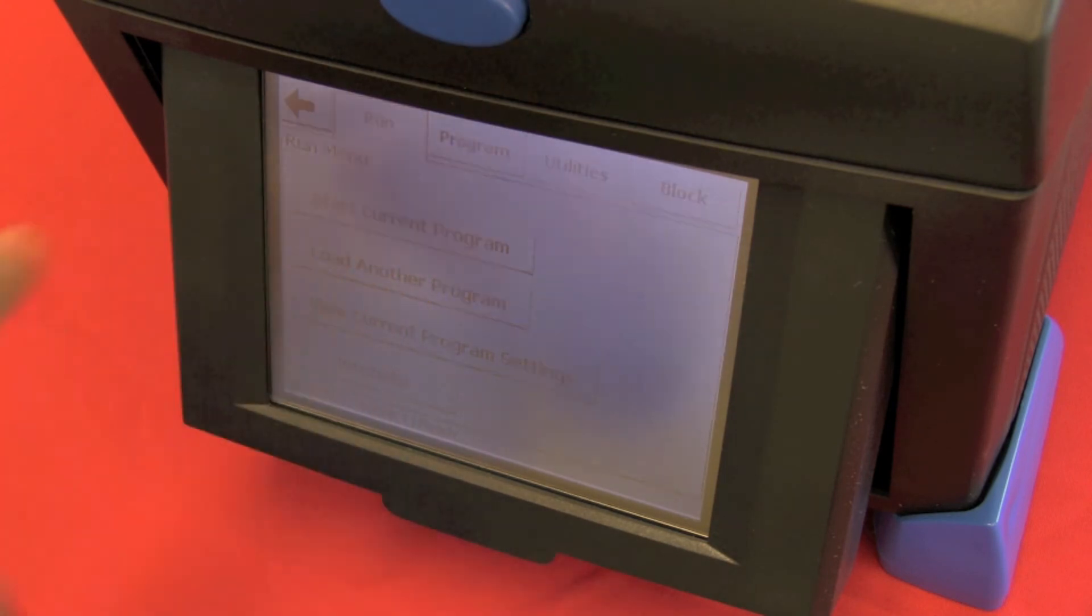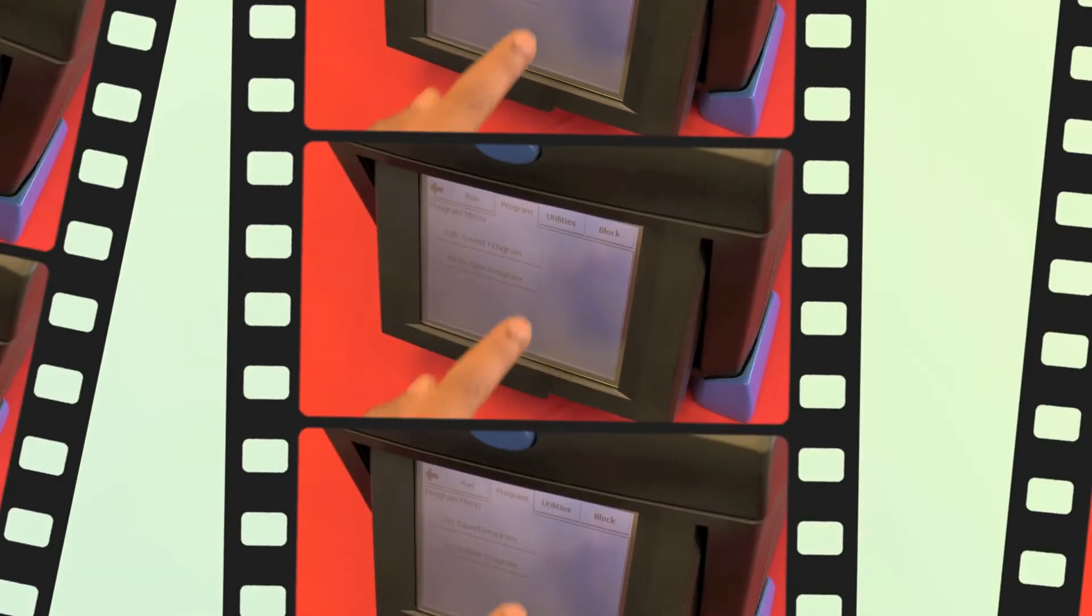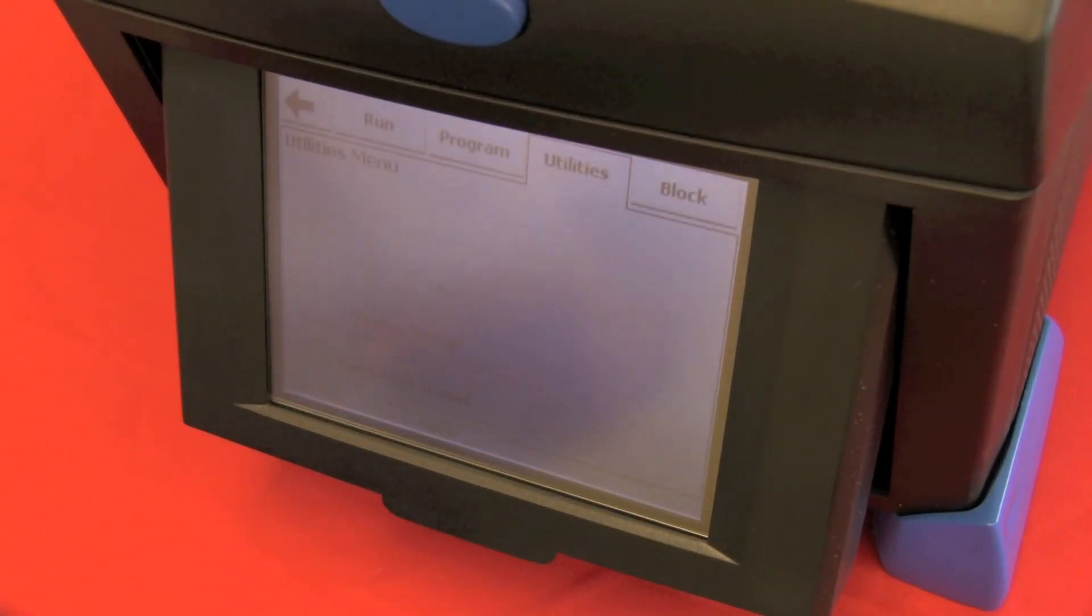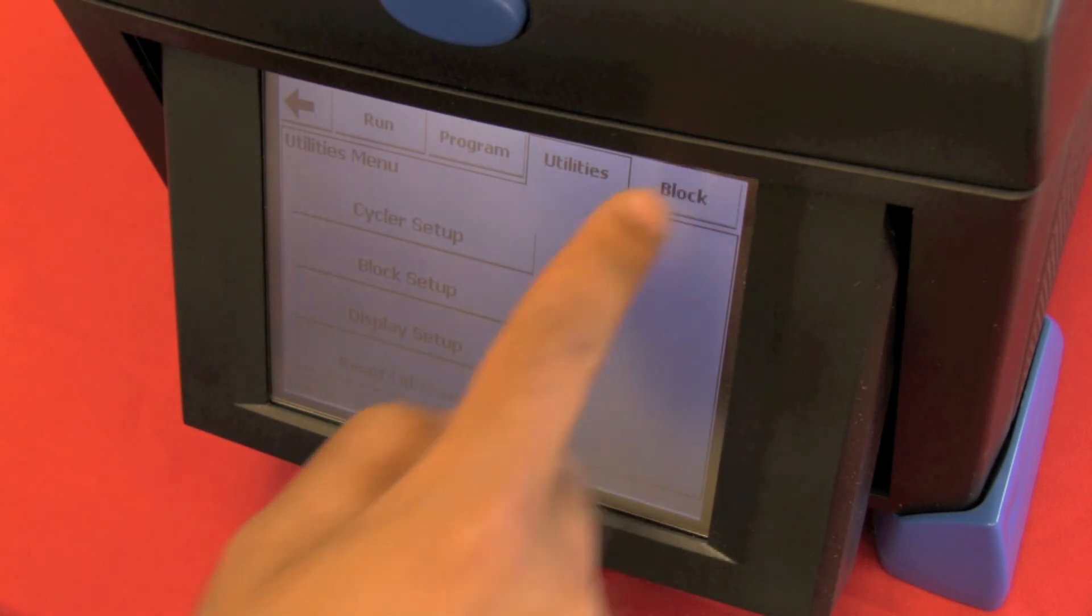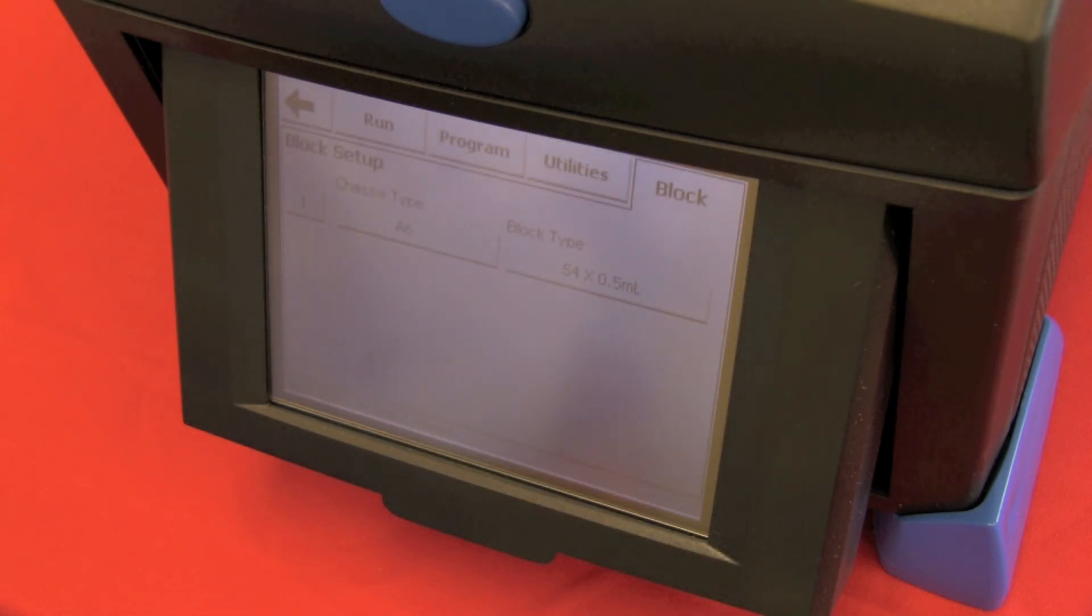If we go into the program menu, we can edit our saved programs, write a new program. If we go into those, we'll obviously have the ability to change parameters as required. If we go into utilities, we see other options like your cycler setup, your block setup, your display setup, and reset lid travel. And if we look at the final option of block, we can see which block is actually in there at any given time.